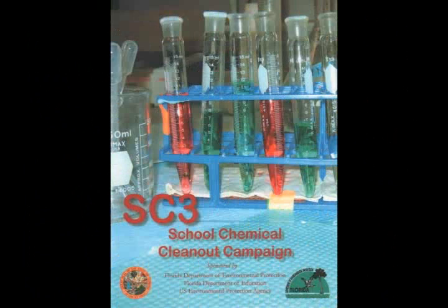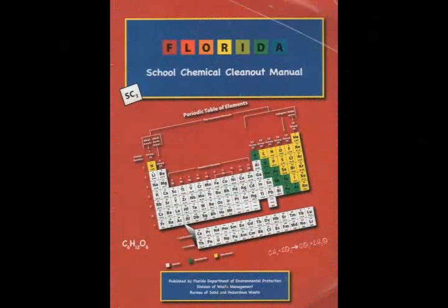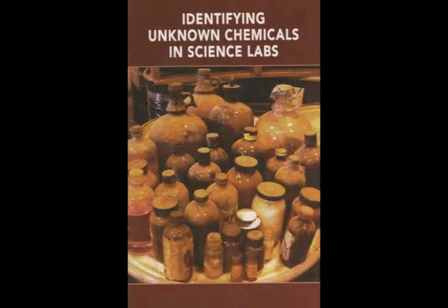This notebook includes general information, including a list of especially hazardous chemicals. Here is a how-to manual for chemical management in schools and simple techniques for identifying unknown chemicals commonly found in schools. We hope that this video has helped you plan and perform an inventory of your school's chemicals so that you can ensure that they are being correctly stored, recognize imminent threat and high-risk chemicals, and note any chemicals in excessive amounts or no longer being used. Please contact DEP for any needed assistance to ensure that your school provides a safe environment for you, your students, and your community.